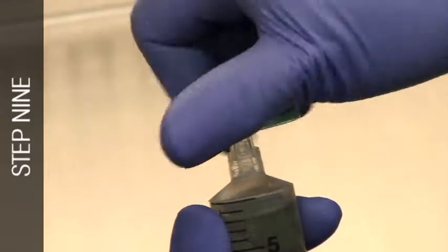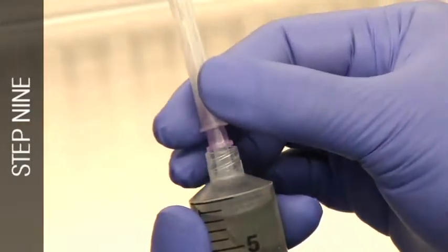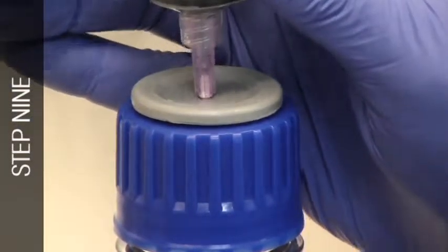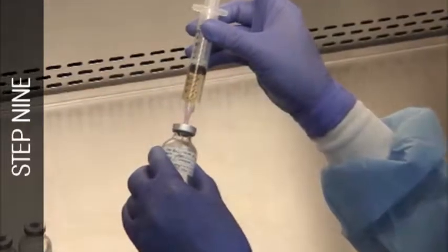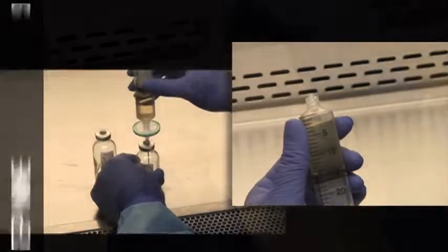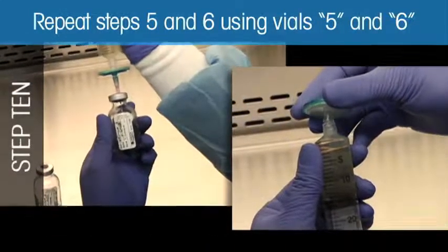Aseptically remove the filter unit and needle, then return the needle to the syringe. Repeat steps 5 and 6 using vials labeled 5 and 6.